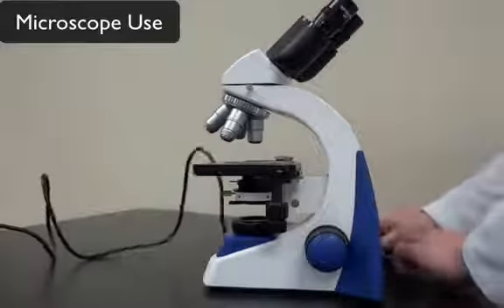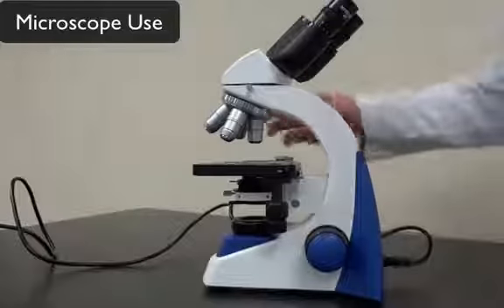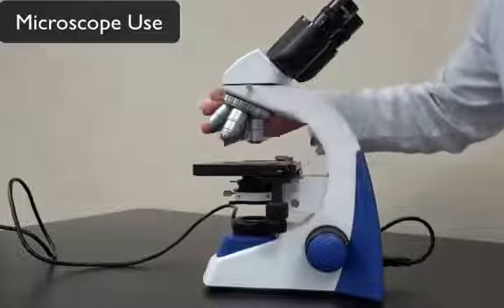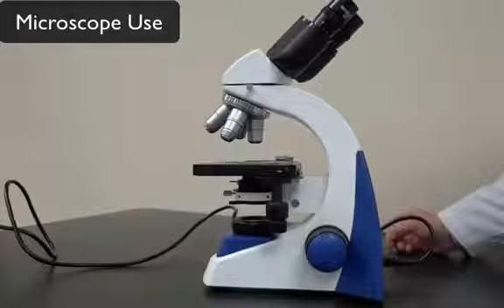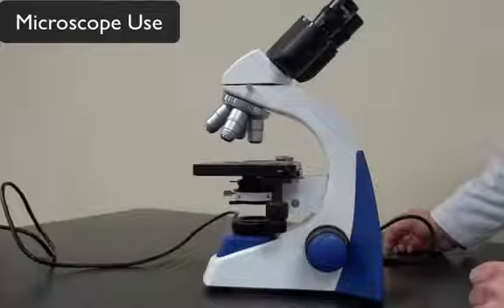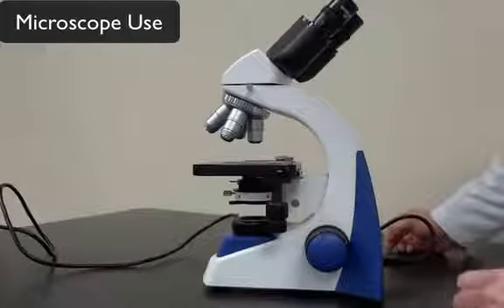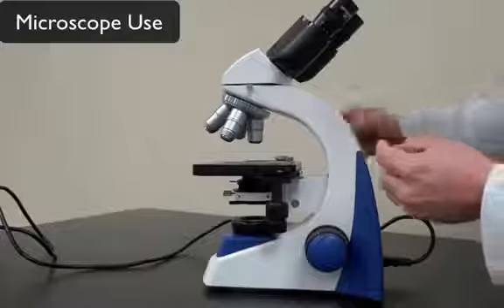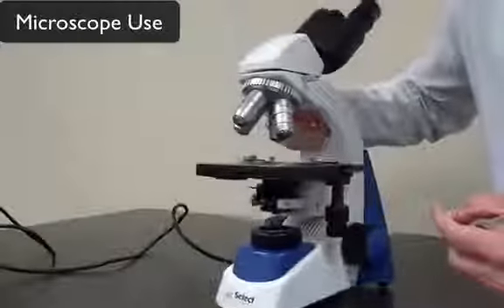And when it's at its lowest setting, you will notice that the scanning lens should be in place, clicked into place here too. So with that, if those two things are set, the scanning objective lens is set in its place, and the stage is at its lowest setting, you can grab your microscope slide, and what you're going to do is I'm going to turn it here a bit.